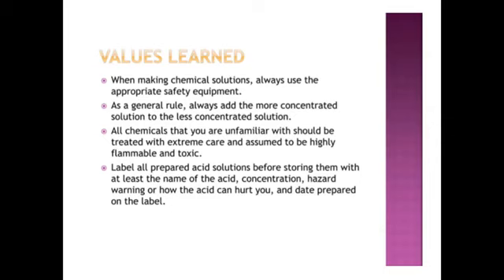So by the time you are done with preparing, please ensure that whether it is acid or base, whatever solution you have prepared and transferred from the volumetric flask to the reagent bottles, before storing them, put the name of the acid. For instance, put H2SO4 if it's H2SO4 that you have prepared, and then put the concentration. Maybe you prepared 3 molar H2SO4. You put the hazard or warning sign.